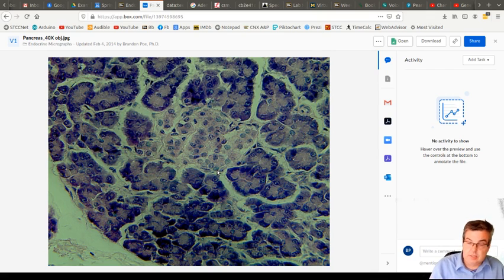Alpha cells release glucagon, beta cells, like this one in the middle, release insulin. I think there's a gamma cell in there too, which is a little bit beyond my understanding of the insulin story. So those aren't the only cells, but the only ones that we're talking about are alpha cells and beta cells. And that's what we see there.